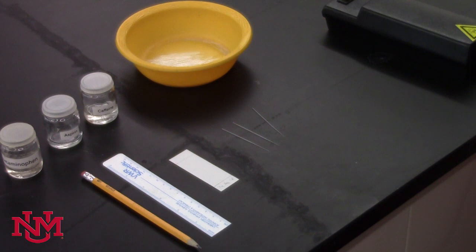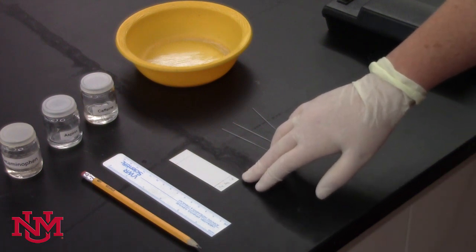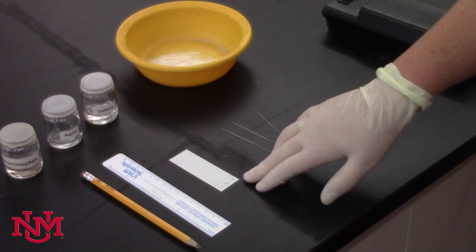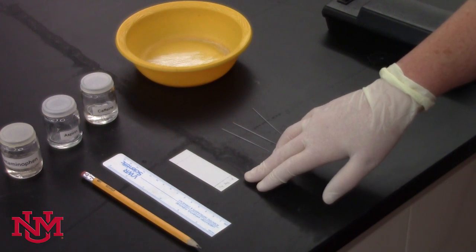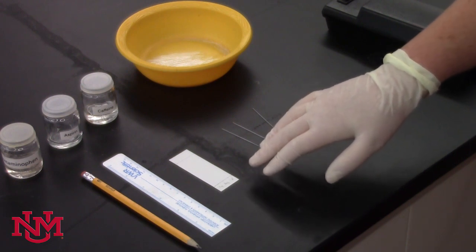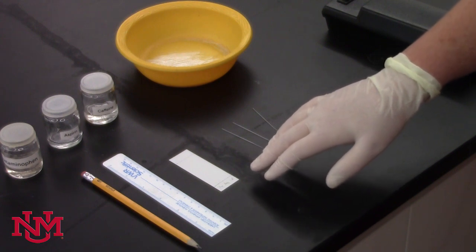Alumina is just aluminum oxide, and it's fairly polar. The idea behind TLC is that samples are either stuck and clinging to the solid support, or they want to move with a solvent up the plate. Try not to handle the TLC plate with your bare hands and hold it by the edges.